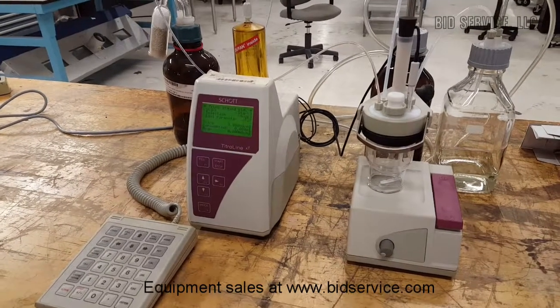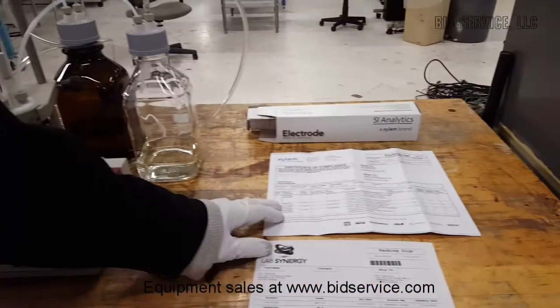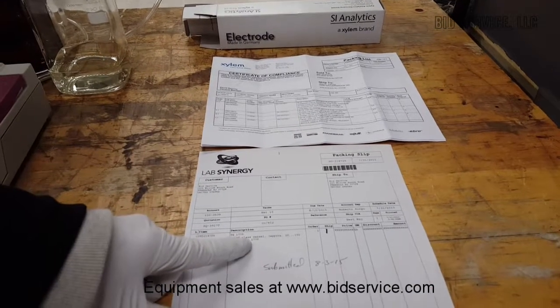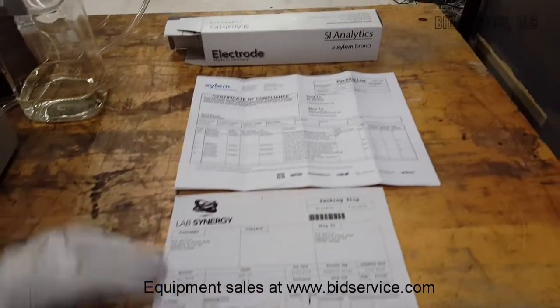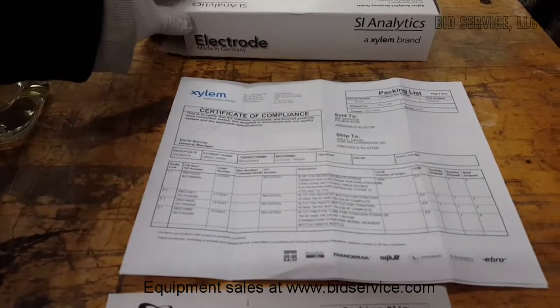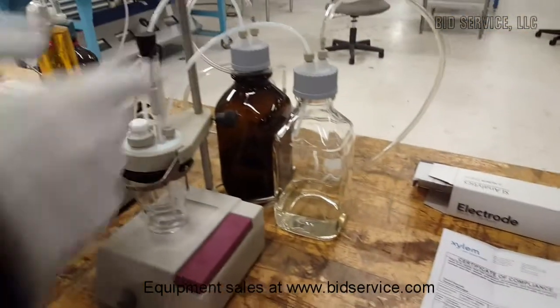This is the Scott Titroline KF titrator. I just want to point out, we were just looking at the packing list. We purchased a new Duran glass vessel back in August of 2015, but that order was canceled. And then just recently, we purchased the electrode waste bottle, solvent bottle, and some of the tubing.